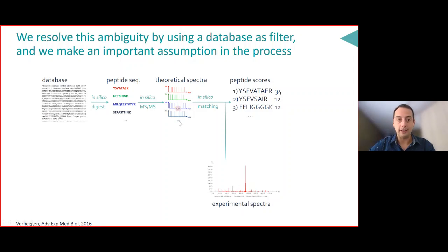We have a library, a limiting set of spectra here, usually less spectra than there are theoretical peptides, because it's a smaller number of peptides that we have seen so far in the mass spec, and then we use that kind of matching, so it's the same principle.